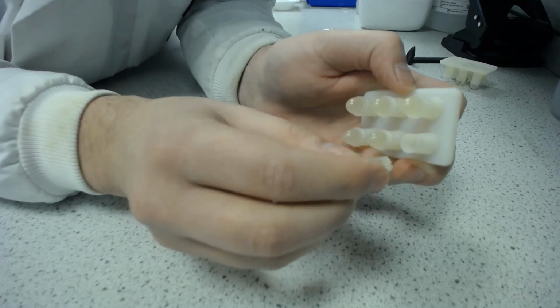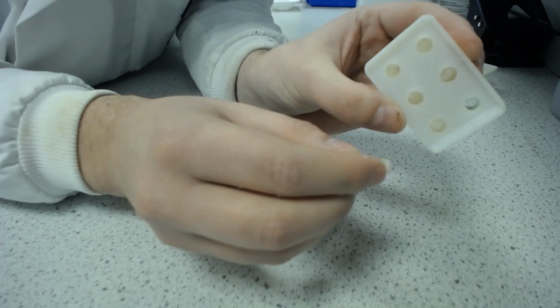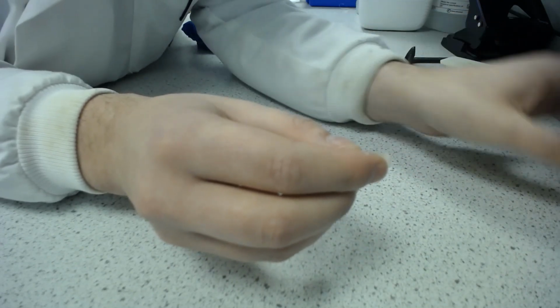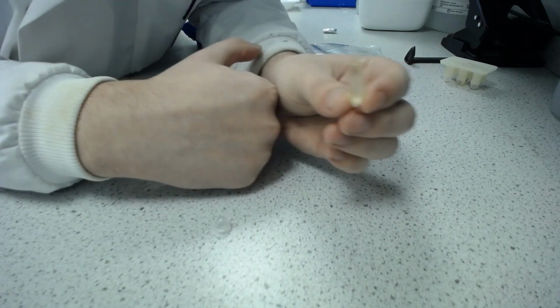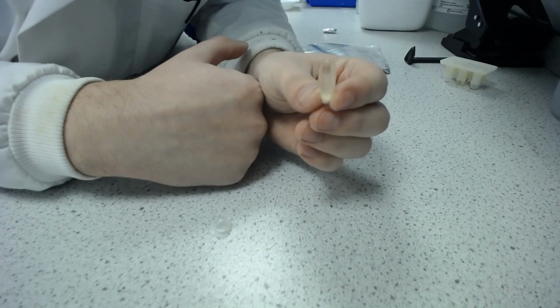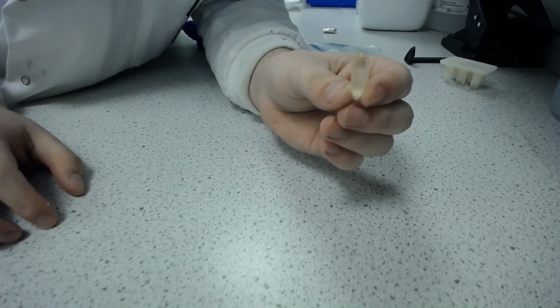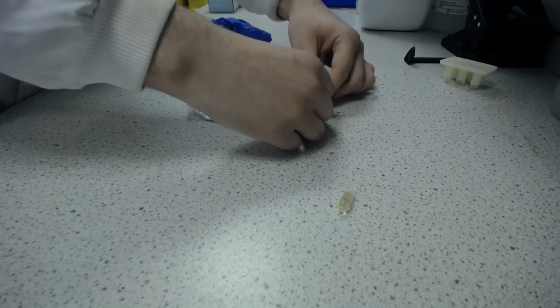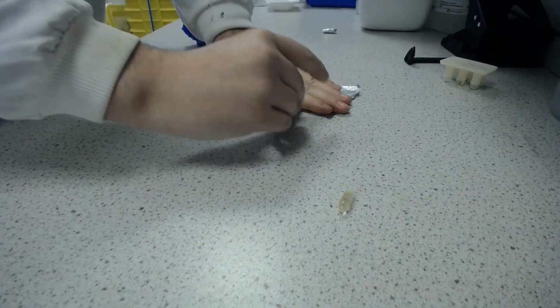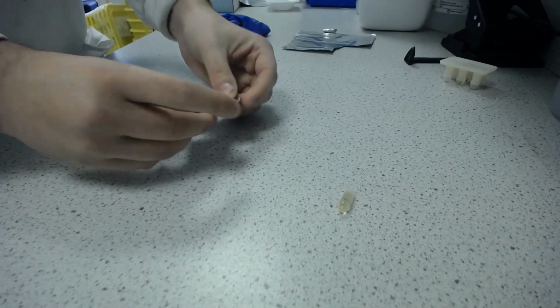So that came out once it had unstuck from the side, so you can see we've got a clean mould and we're left with one glycerol suppository, like so. So we're going to wrap that now, and we're going to do that just with a small square of foil. Now you can do this however you'd like, just to make it look elegant or nice.